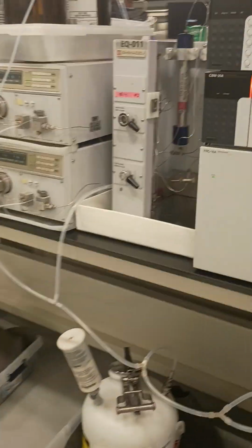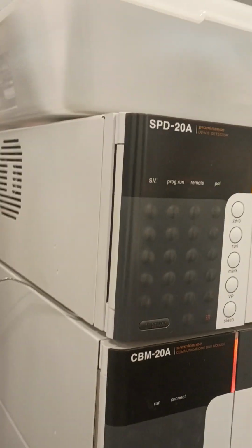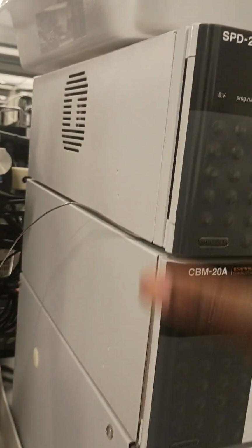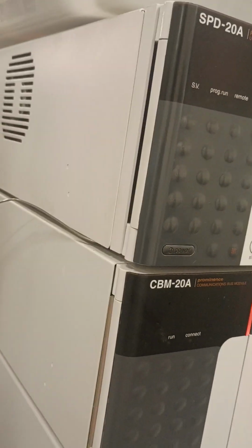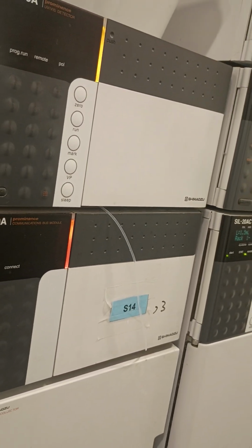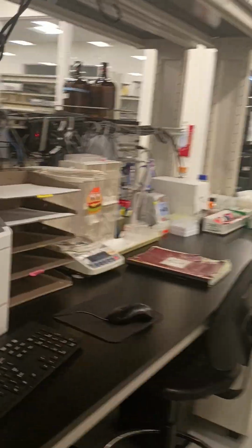This is what we use. This is the old one that you see on the paper. These are the old purifiers. This one right here, at this point, it's off. That's why you see these two lights. This one is running, this is an analytical. We're talking purifiers first. This is how it's supposed to look when it's off. If it's on, it's going to be green, just like in the SOP. Does it turn off on its own? No, we turn it off, and I'll show you that part.